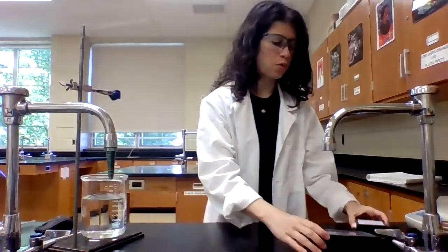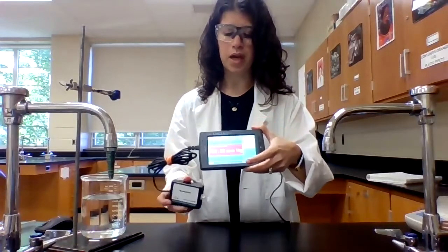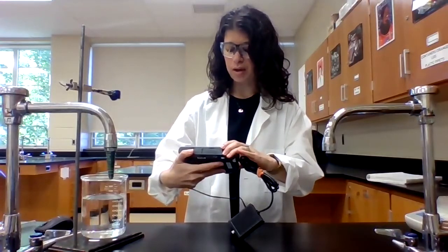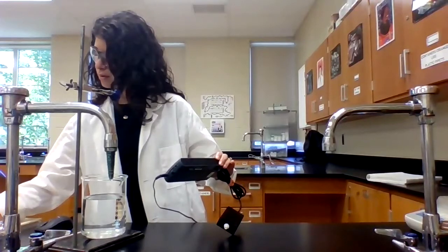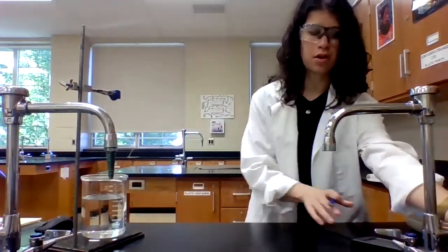All right, so the first thing we need to do is record the pressure of the room. What I have here is a barometer hooked up to our lab. I have our units in millimeters of mercury, and this is reading 749.85 millimeters of mercury. So we're going to record that in our lab notebook. Okay, so that is our room pressure currently.